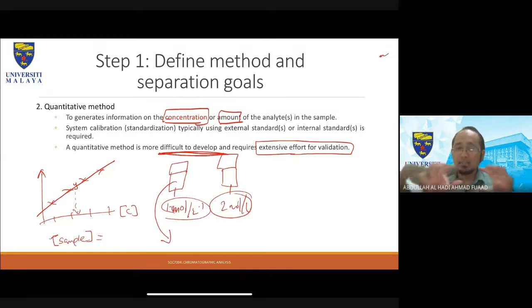So, a lot of standards. Of course, if you have done it previously, especially if your machine is calibrated according to the time scale it needs to be calibrated, then you might not need to do these 3 experiments at 3 different times. But nonetheless, validation is very important. So it's best to do it at 3 different time points instead of a single time point with many similar samples. Three different time points is better than running 3 runs in the same day. Variation between days is also critical, and that is something analytical chemists really look into.